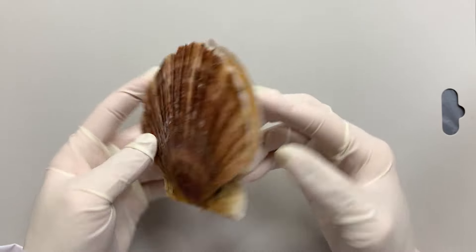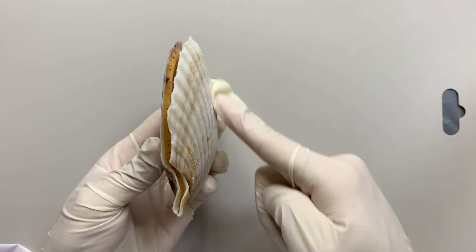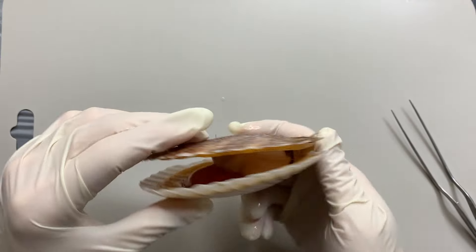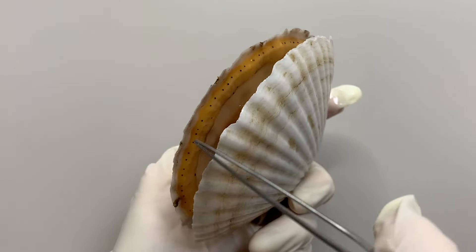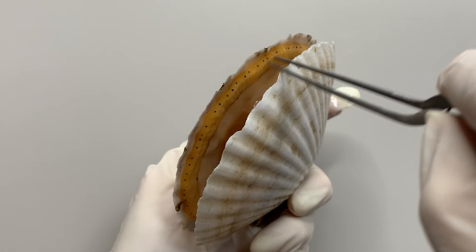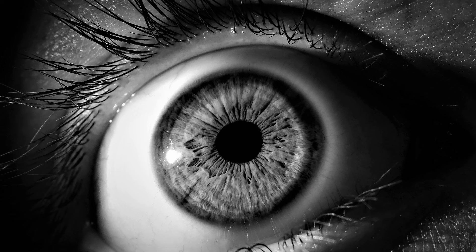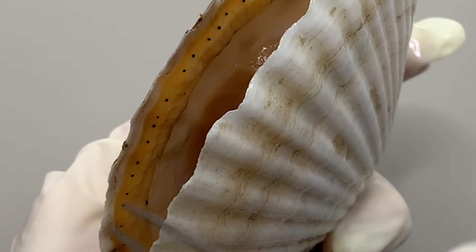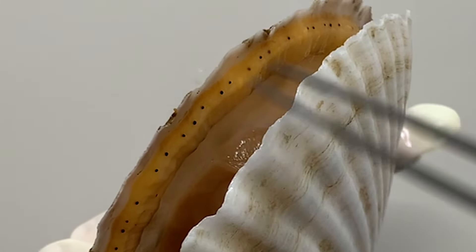First, if you look at the shell, the underside is a little bit more concave and wider than the top. And surprisingly, the spots that you see on the edges of the shell are all scallops' eyes. Unlike other bivalvia that don't have eyes, scallops have about 200 eyes on the edge of the mantle.